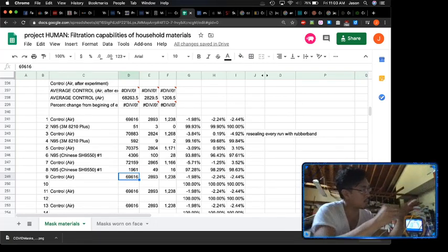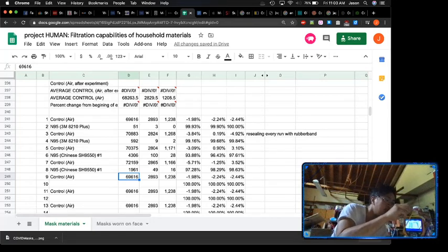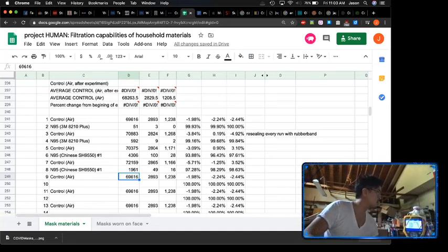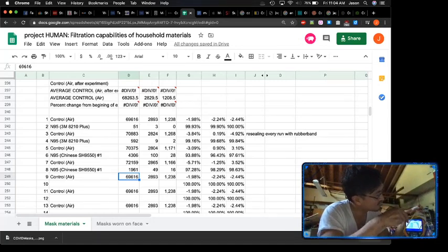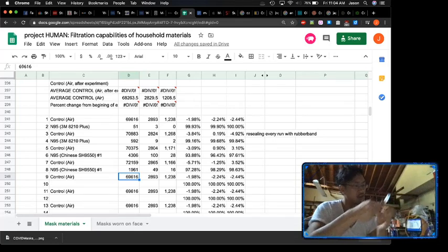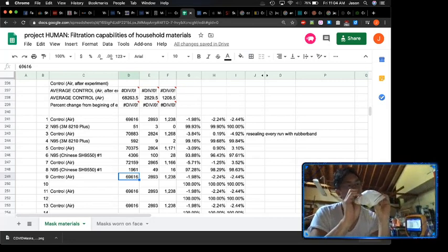Okay, you know, this might warrant doing another run. Man, I really sealed this one tight. So I think the material is actually decent. I think I just... God damn it. Science. Oh yeah, this fork is great. I think the material is decent.